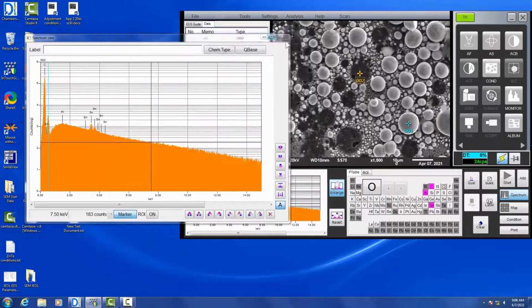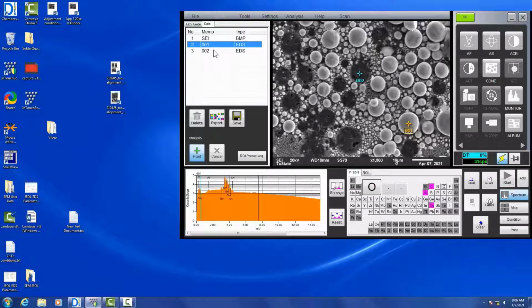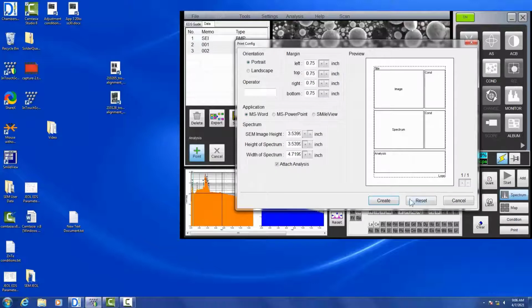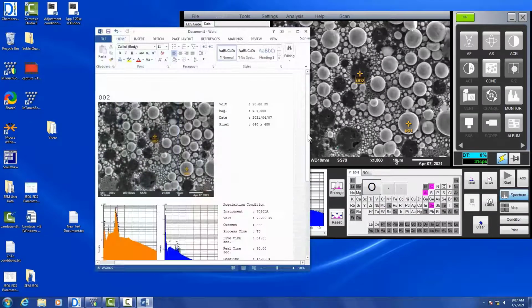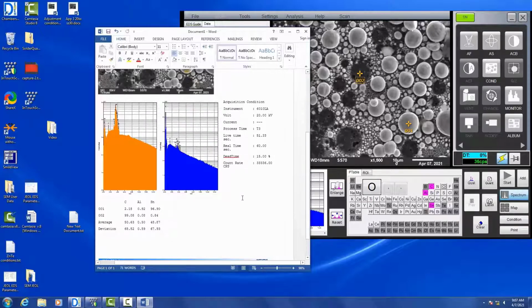And the point of doing multiple spots, we want to see that image with both the spots and then get the data with both the spots. So what we're going to do is we're going to select both points, so hold down your shift, and then create the report when both are selected. As we can see, the 2 graphs are on there. 2 spots are going to be on the image, and then you'll have your 2 analysis points also for spot 1 and spot 2.